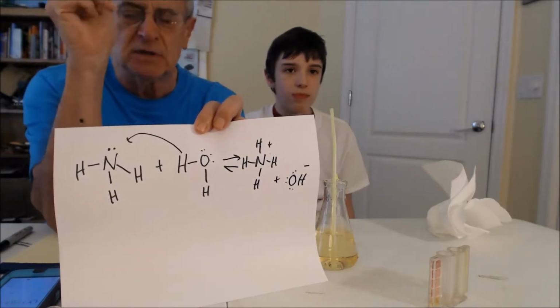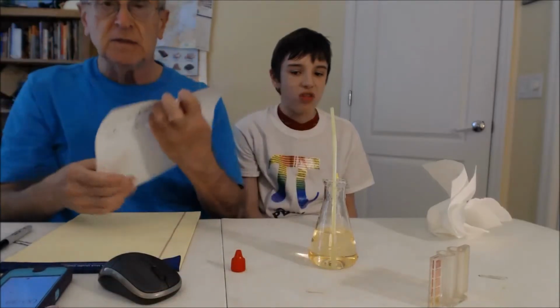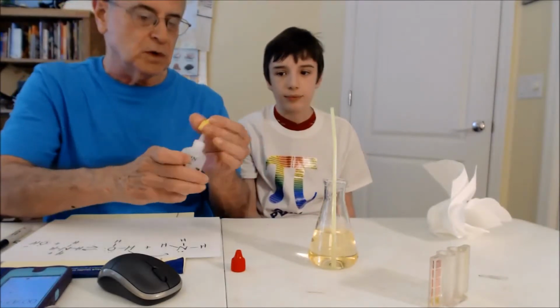This only happens to a few percent. It doesn't go to completion by any means. But it is a base. It's a weak base. All right, so I'm going to first try this ammonia. I've had it around. I hope it works.